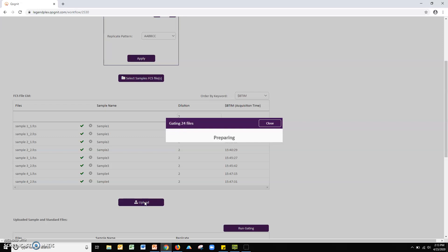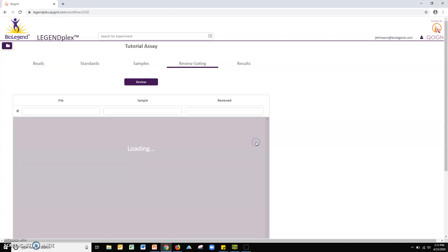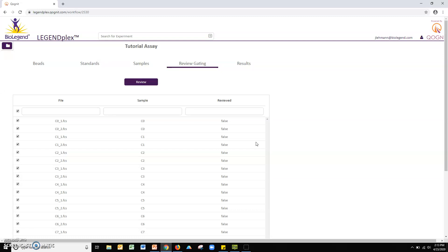Wait for the program to gate all files, then click review to proceed to the gating review steps. Select all files you wish to review from the list displayed by the software. Note, the default setting includes all uploaded files. Click review.